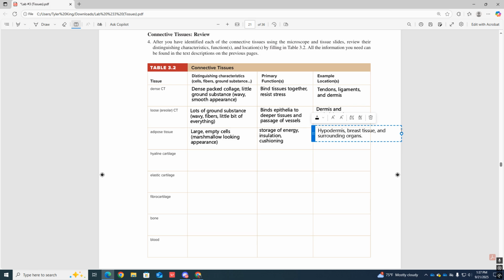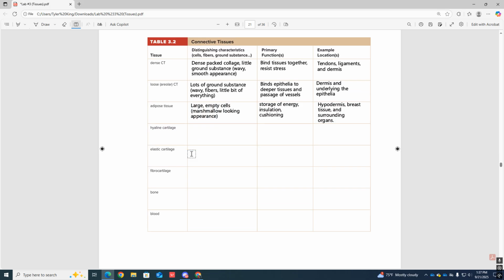All right. Perfect. Hyaline cartilage. Remember, this is the first of the 3 types of cartilage. We have 1, 2, and 3. That subcategory. Hyaline. Remember what you're going to see here: a smooth, glassy appearance. How about the lacunae? Lacunae arranged in pairs is primarily what you're going to see. This is primarily for flexible support, so you'll find this in a lot of the articular joints that we have.